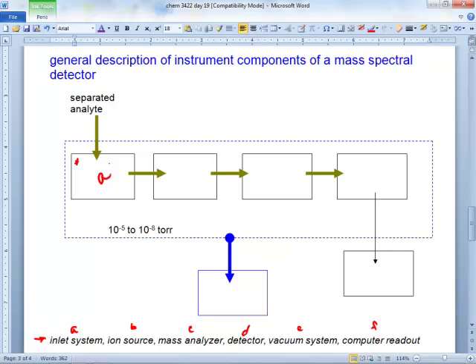So the stuff is coming out of the chromatograph, and it goes through this funky engineering inlet system, and then it probably goes to where? Yeah, it has to get analyzed. So good. It gets ionized. Hopefully 1 in a million is going to get ionized. If it doesn't get ionized, would it keep going straight?